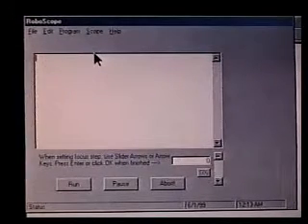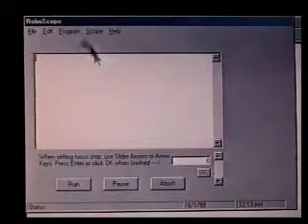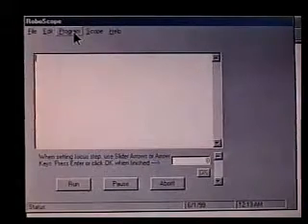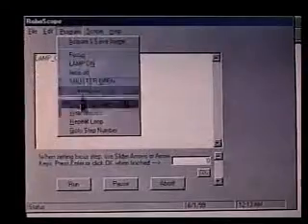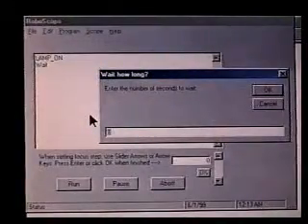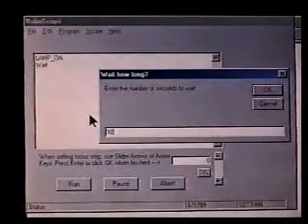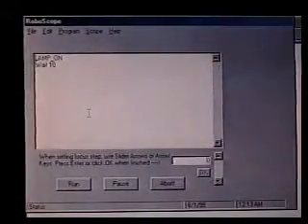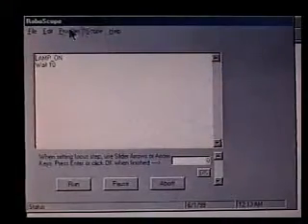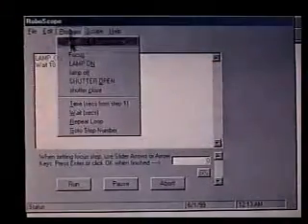Here we go. To start out with, we will have the microscope turn the lamp on. We will wait ten seconds so that the lamp has a chance to stabilize, and then we will acquire an image.